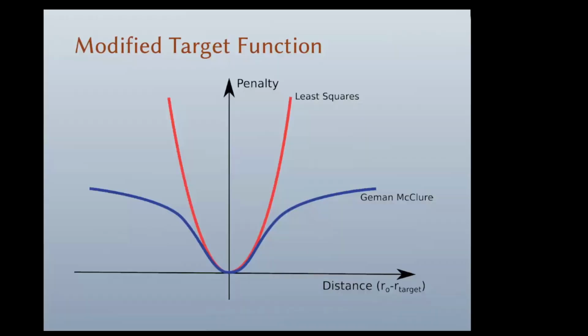Right. So very typically, we use Hooke's law in the formulation of the target function, the penalty function. So if we have a distance, let's say, and we move, I'm going to try to represent that here. So if we move a little way, if I put my cursor on the screen, can you see that? No. Okay.